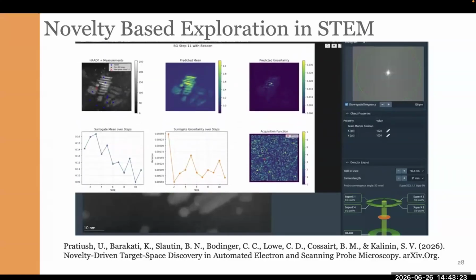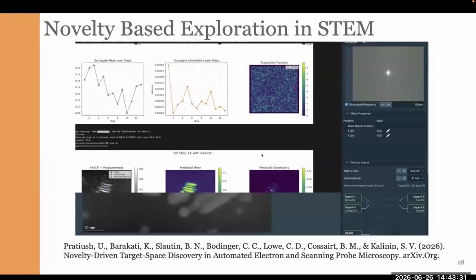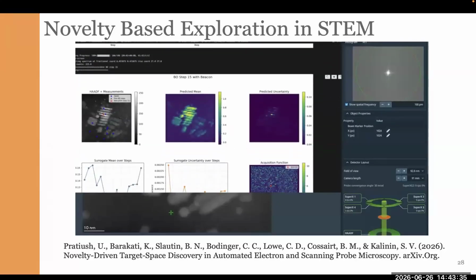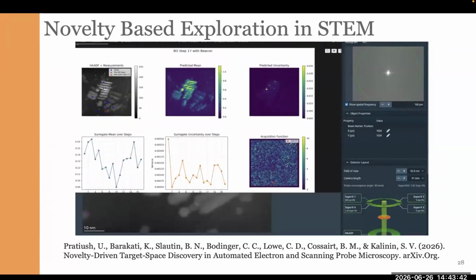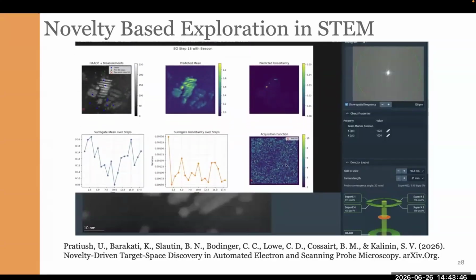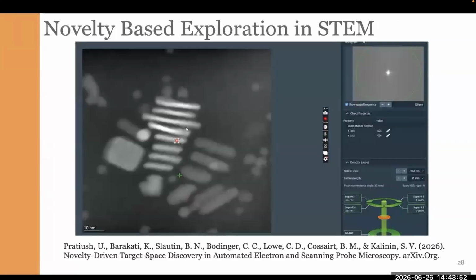So as you may see, it's a Bayesian-based approach. We are selecting, in this case, not only particles, but also different regions within a single particle, and different particles which look different in terms of structure and composition, and we are trying to investigate and explore them. Yeah, I think that's pretty much it.